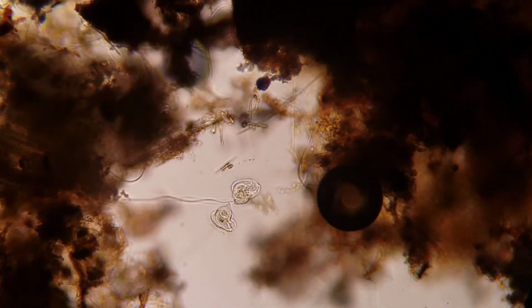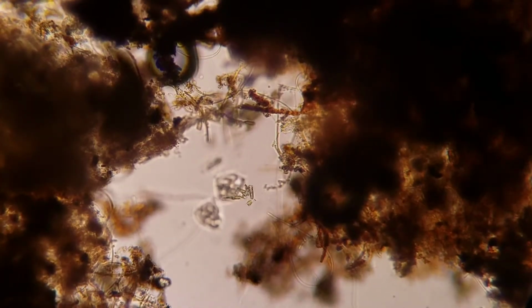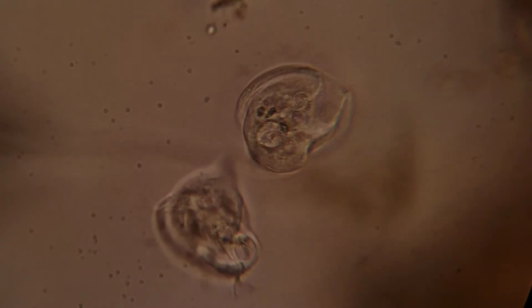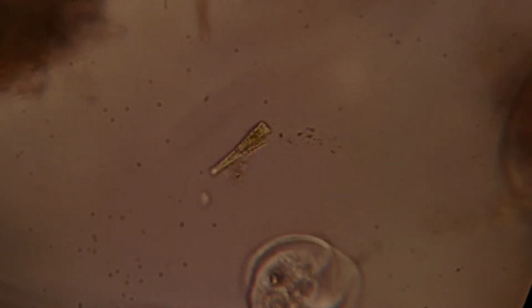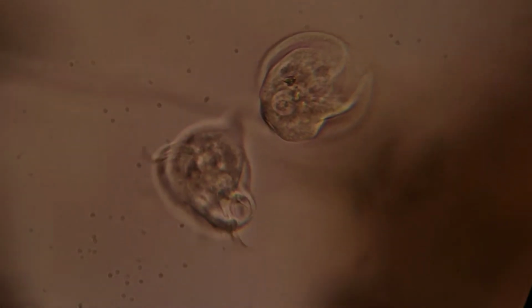It's two Vorticella. You can see each one has their own little string and they're intertwined. Some in the background, oh, they're spinning up a whole bunch of diatoms in the current they're making. Another one at the top spinning. Let's see if we can get a little closer look. Brighten this image up here. So they have little tiny hairs that beat around, and as you can see, it makes a current. They're filter feeders. Probably eating bacteria. The diatoms are much too big for them to digest, I would imagine, but they're probably looking for bacteria.